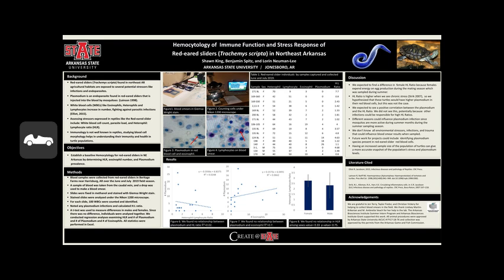I am a biological science major, and I had the pleasure of participating in the Arkansas Biosciences Institute internship in the summer of 2019 with Dr. Neuman-Lee and her lab. I have continued to work in the lab, my focus being on my work to examine blood samples from red-eared sliders by making smears and observing them under the microscope for immune cell morphology and relative proportions.